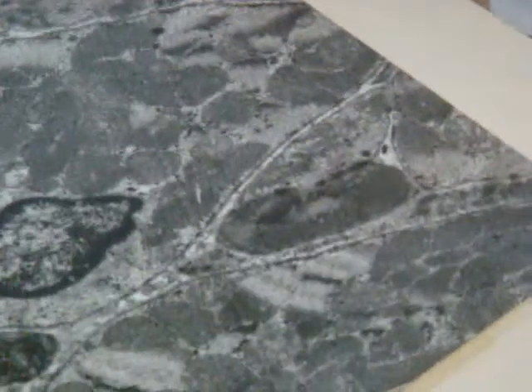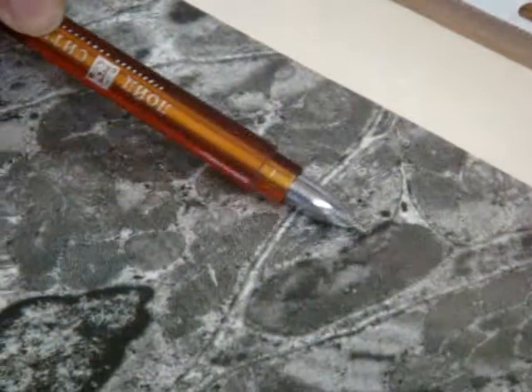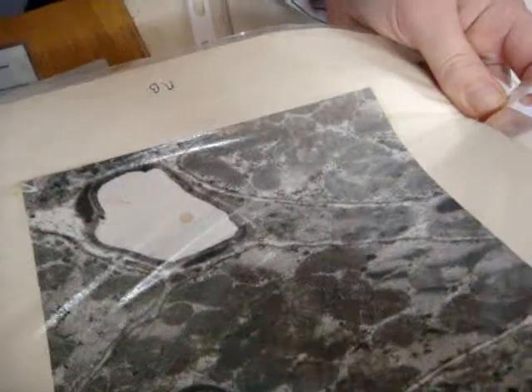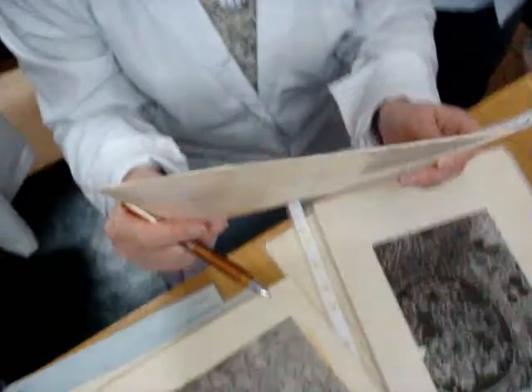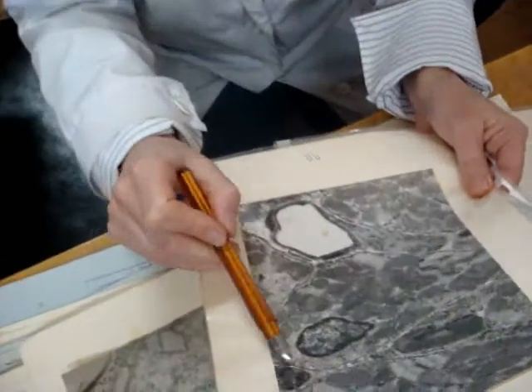This tissue, muscle tissue, junction, so this is cardiac. And nuclei are approximately in the center, yes, this is a blood vessel. But if we can see very clear, no, look please, what is it? Oblique section. This is an unmyelinated nerve fiber. Axon, fibroblast here. What is it? This is a fibroblast and an unmyelinated axon.